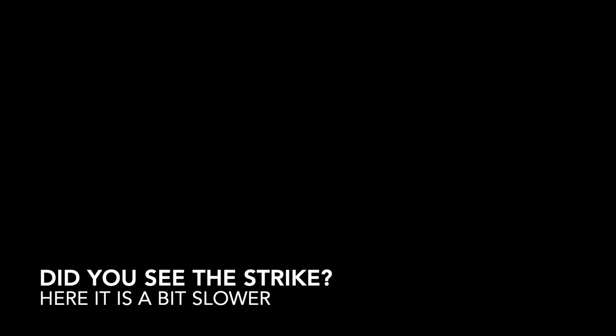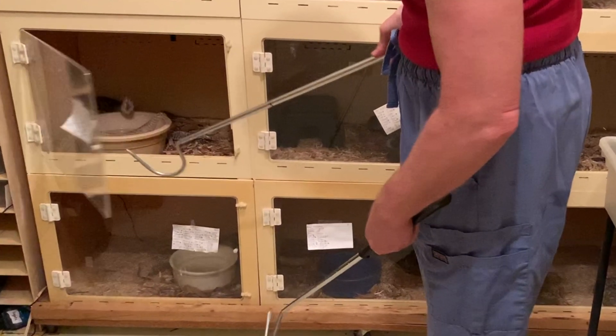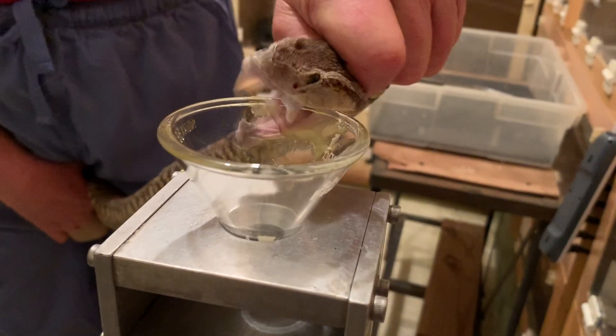In case you didn't see the strike, here it is in slow motion. It was pretty quick. This snake also sprayed venom when it struck the funnel — you can see it in the slow clip right there.